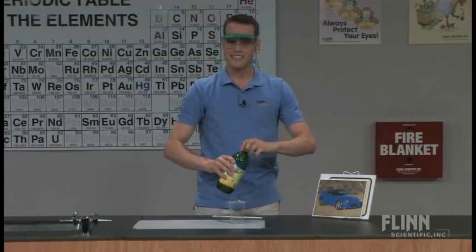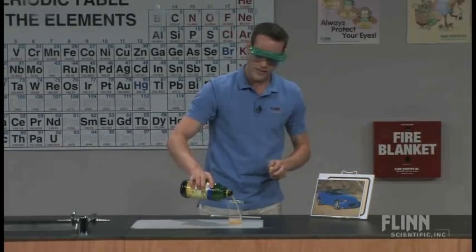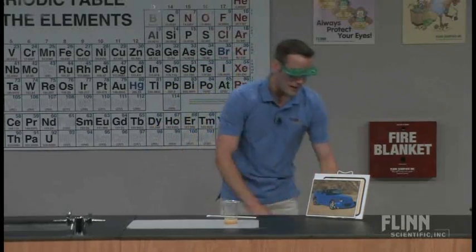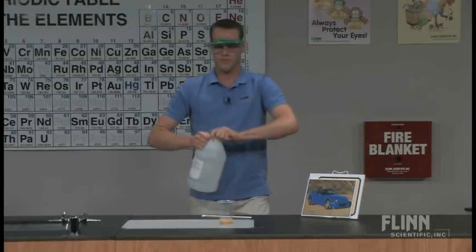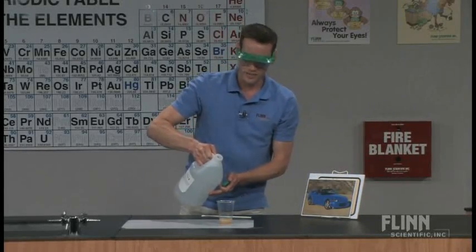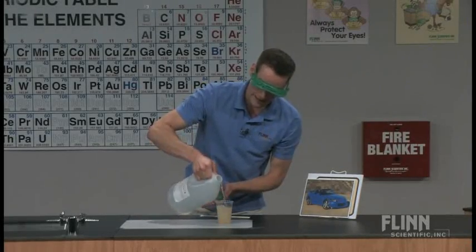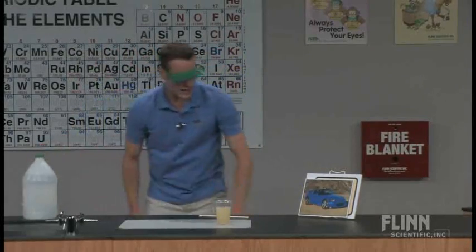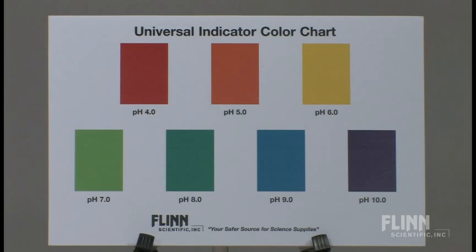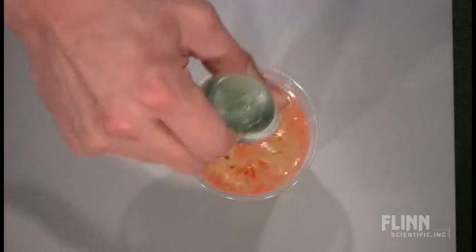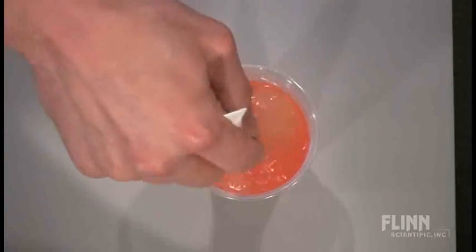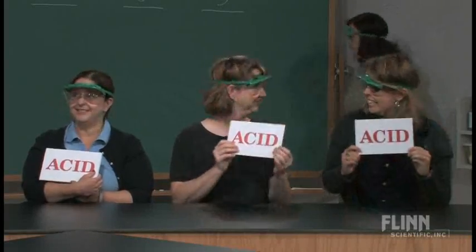Let's find out. Now to test all of my acids and bases today, I have the help of Universal Indicator. Unfortunately, lemon juice is already a little bit colored, so I'm going to add some water to dilute it down — make sure you're using distilled or deionized, by the way. Universal Indicator turns red under acidic conditions and blue-violet under basic conditions, but it goes the full spectrum. Green is about neutral, blue-violet is a little bit basic, and red-orange is a lot acidic. It looks like we have red, so we have acid.